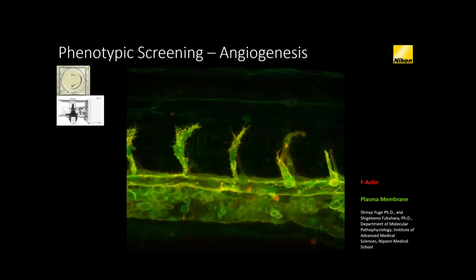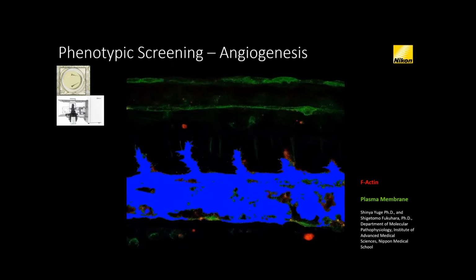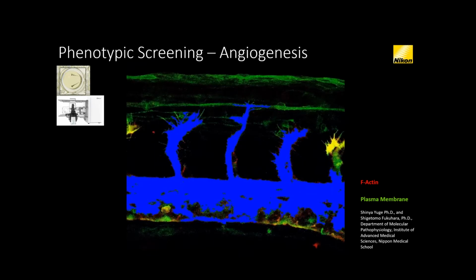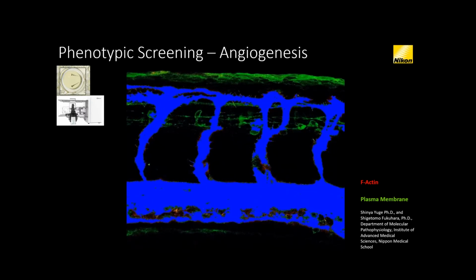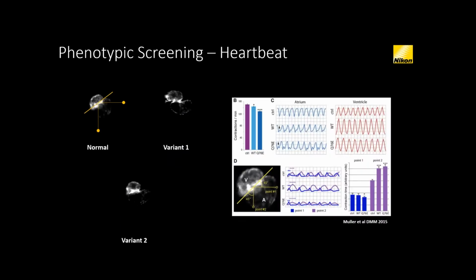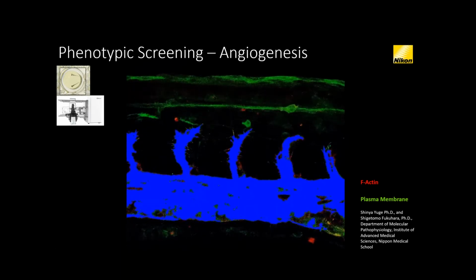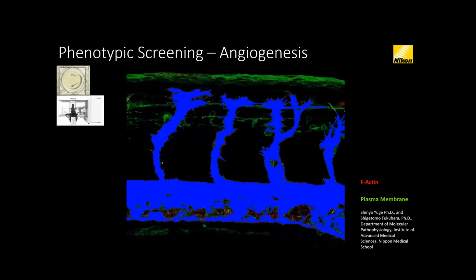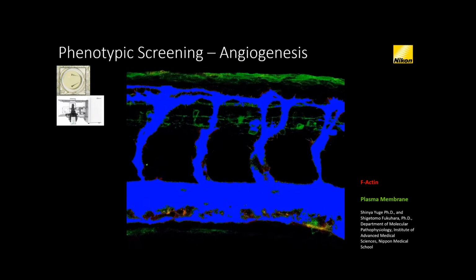This process can be seen in real time and with high detail, and we can apply modern software analysis techniques, as shown here, to quantify this process. We can look at the volume of the vasculature, we can look at the rate of formation, we can look at the rate of projection generation, and we can measure how much time it takes for these to form. And so not only can we qualitatively watch these processes occur, but having collected the data, now we can go back and use modern imaging techniques to extract quantifiable information. Shown here in blue is just a mask that's been created that follows the growth of the blood vessels over time.